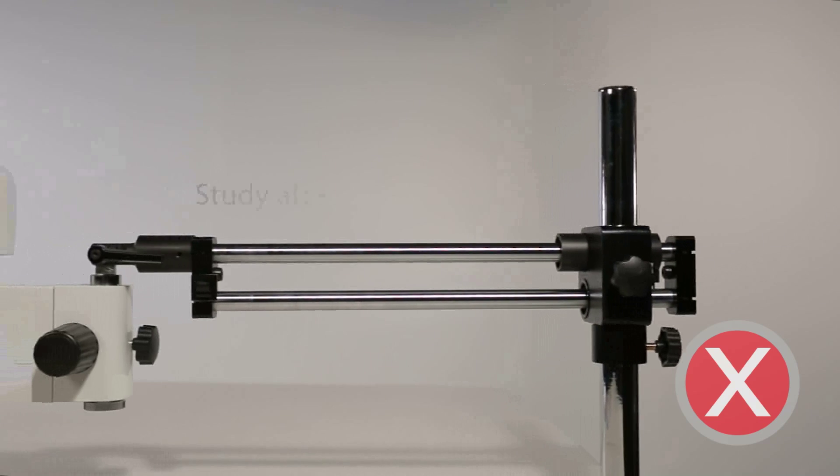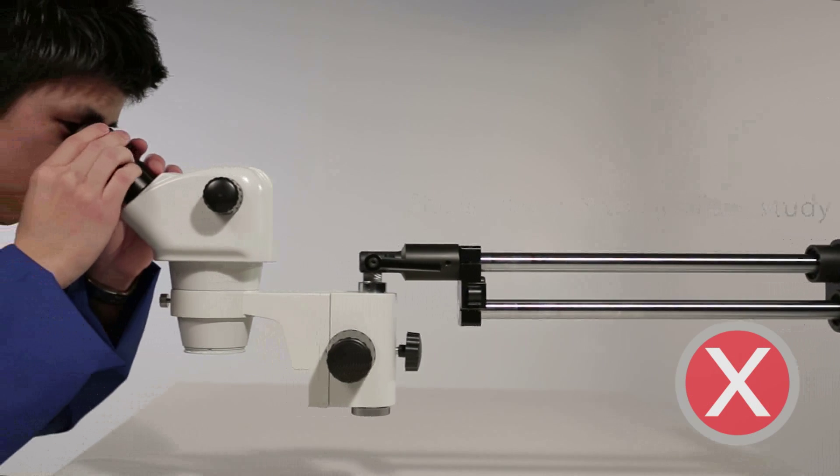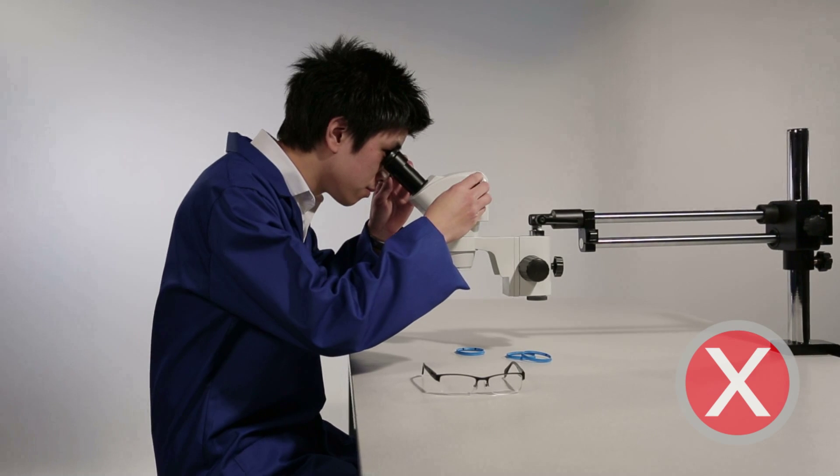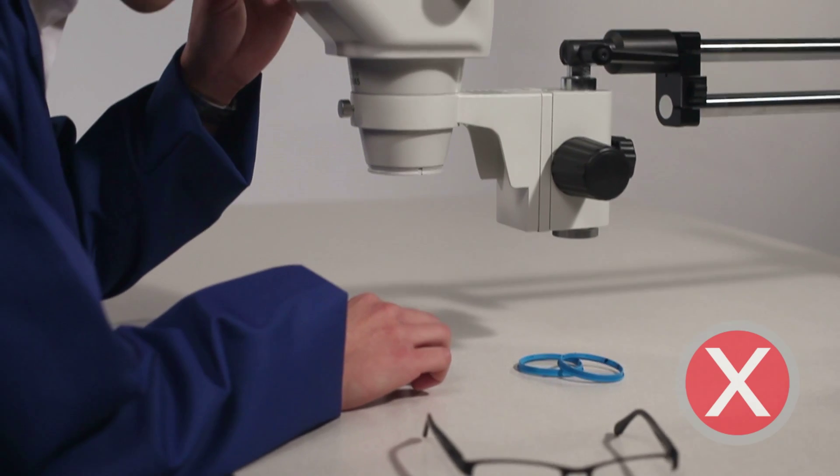Studies have consistently shown that improving ergonomics significantly increases productivity through increased efficiency and quality of work, saving you money.